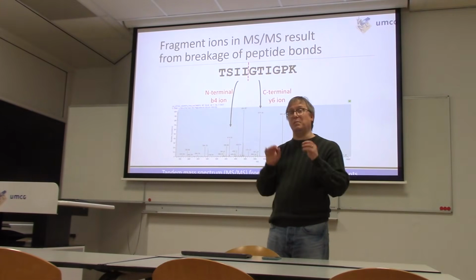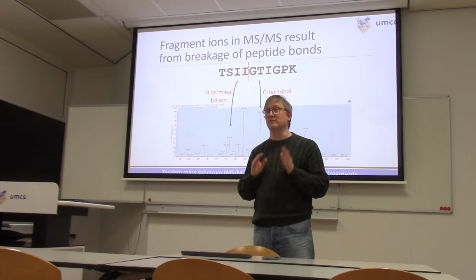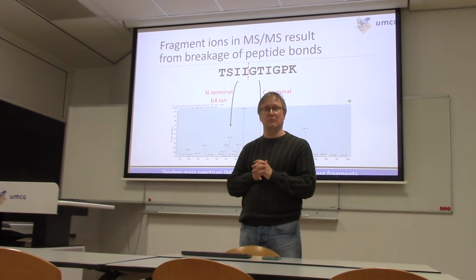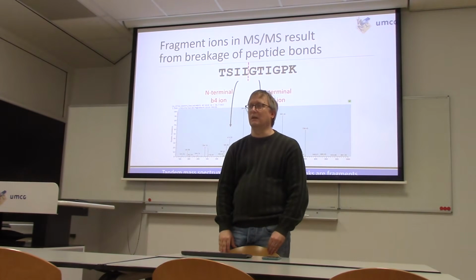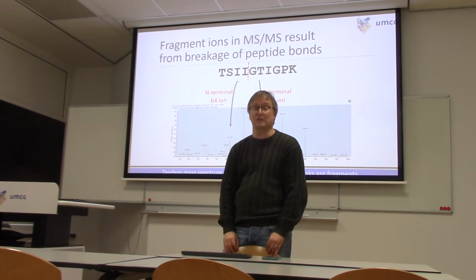Now, is it possible to read a sequence from an MSMS? The jury is kind of split on this one. Some of the great masters in the field of MSMS have created short courses, and properly whole semester courses in some cases, on how to interpret the tandem mass spectra of peptides.